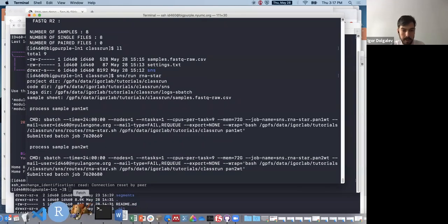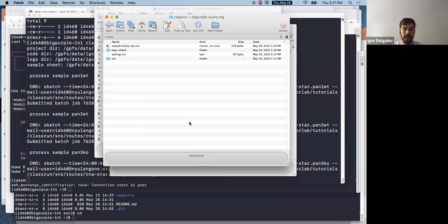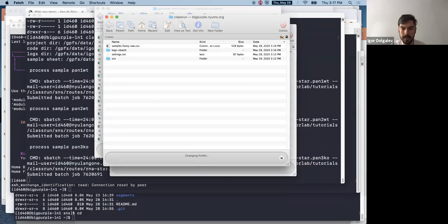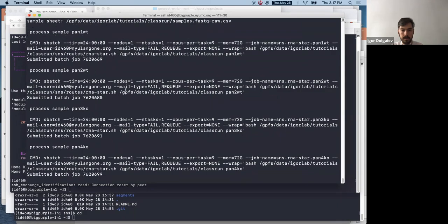Now if I go back to Fetch, let's see if anything is actually happening. Nothing is happening yet, which is not surprising given the stress load. The first few are submitted relatively slowly, and then after the first few, it'll go much quicker.